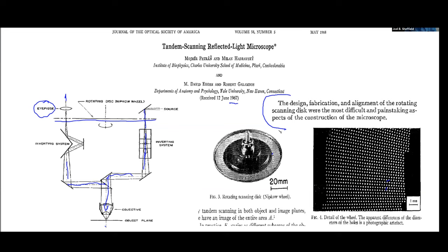But he had set up the idea that the reason it's called tandem was the idea that you get the signal from here merged with the view of it over here, because this disc would bring one of these circles all the way around by the time you looked at it. It was a very, very interesting system, okay? But it didn't go too far.